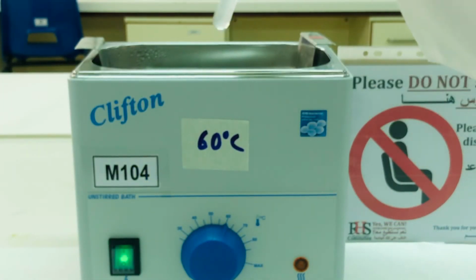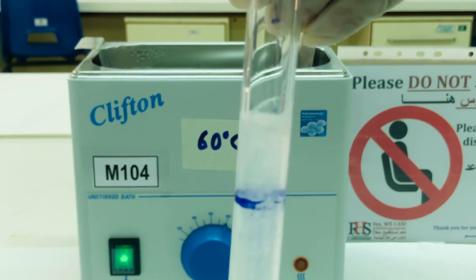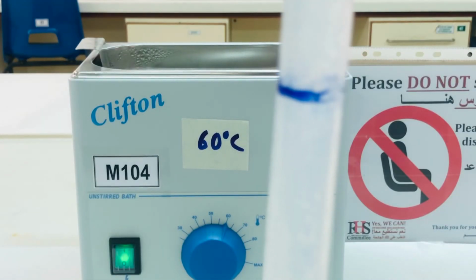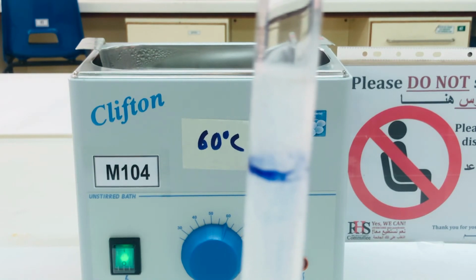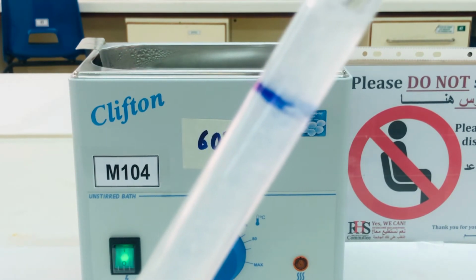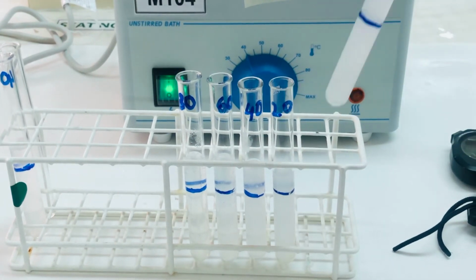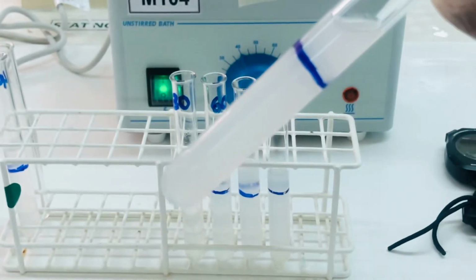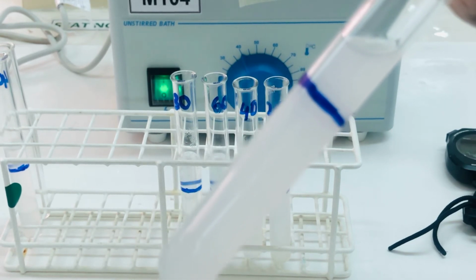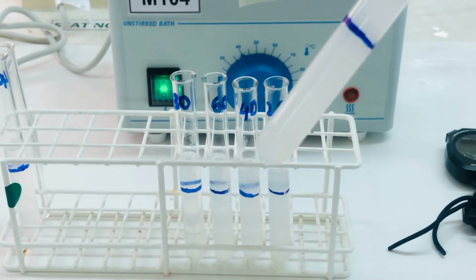For the sample kept at 60 degree, you can see the curdling of milk has taken place. The top part has become transparent. You can see casein protein settling down, and we have noted down the time taken in curdling of the milk. For all the samples, the time has been recorded. What is observed is in 0 degree, there is no change. There is no curdling of milk, no settling of casein protein, and almost no change is observed for 0 degree temperature.